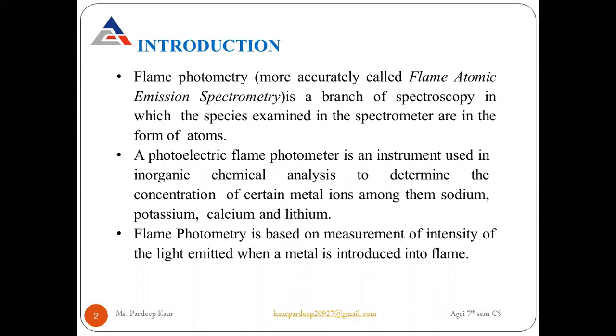A photoelectric flame photometer is an instrument used in inorganic chemical analysis, and it helps to determine the concentration of certain metal ions, for example, sodium, potassium, calcium, and lithium.